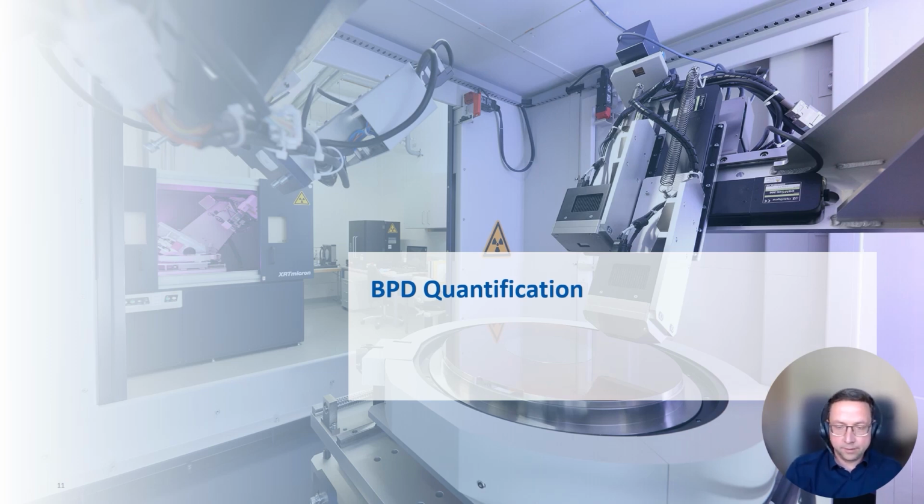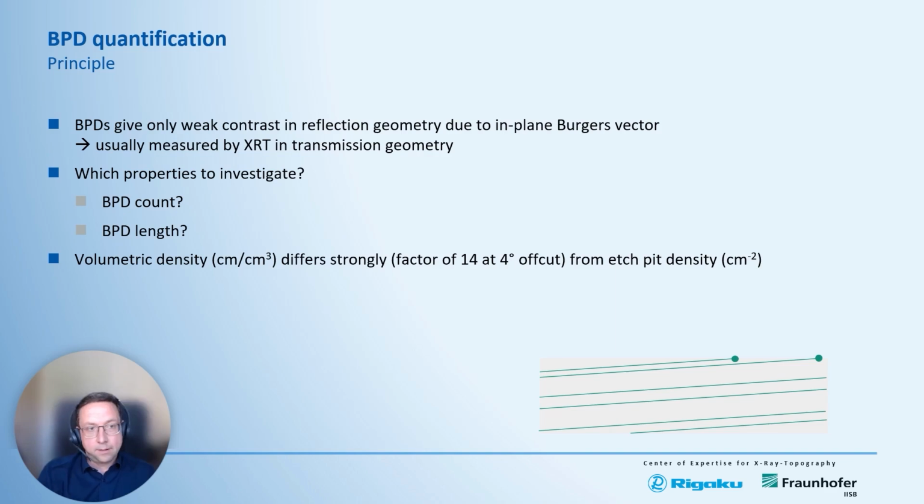Now coming to the BPDs. The BPDs, as I've already introduced in my former slide, are more or less parallel to the wafer surface. The first thing that we have to take into account is that we cannot measure the BPDs just in reflection geometry due to the in-plane Burgers vector. So usually the basal planes are measured in X-ray in transmission geometry.